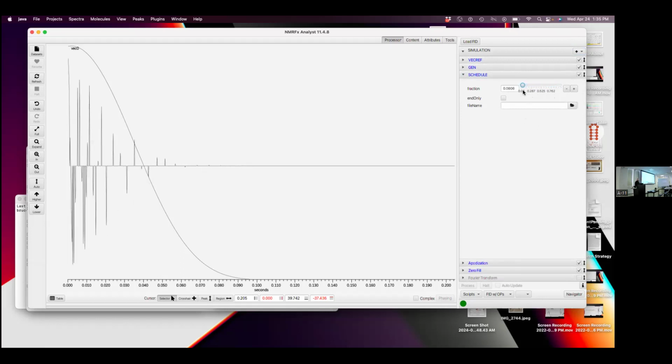That's non-uniform sampling. Basically, it would be better if I showed you individual points. These places where it's flat are basically data points that we haven't actually measured. And so if I measure, as I'm here, 8% of the data points, I can do the experiment in 8% of the time. So if you're time limited, you can get things done much quicker with non-uniform sampling.